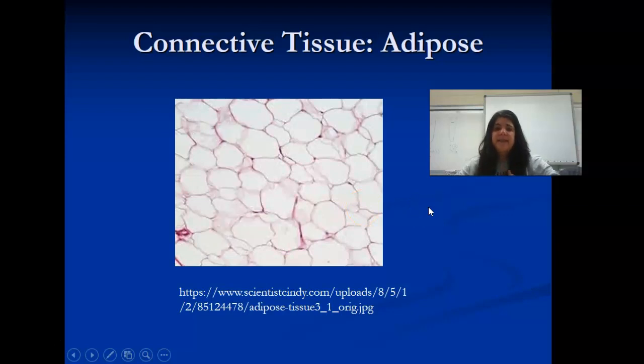Adipose is fat, again in the connective tissue category, and its function is to protect and insulate. I think adipose looks exactly how you would imagine adipose to look, right? These big globs of white cells, packed together pretty tight, again in part because its job is to help insulate and protect. So this small amount of extracellular fluid in here gives it the ability to do that.